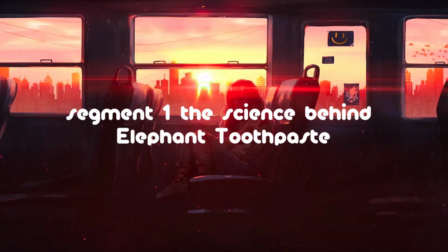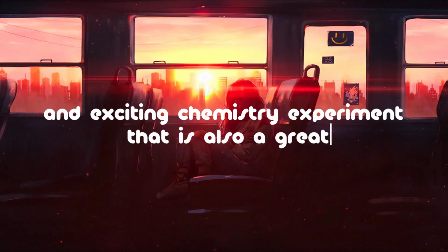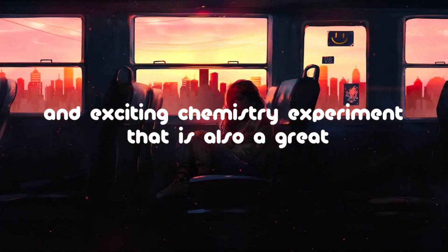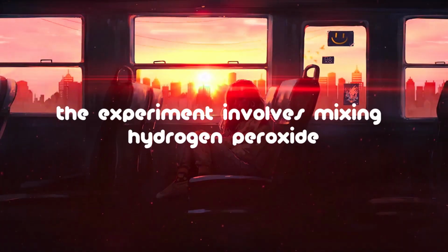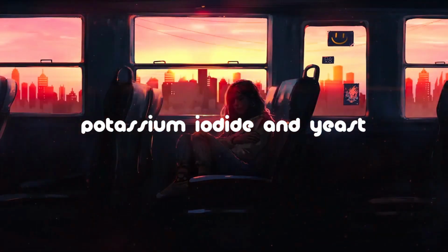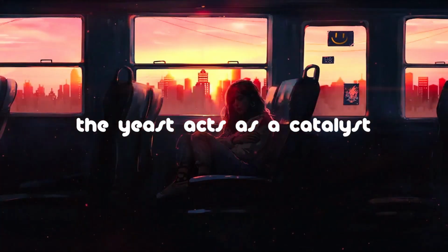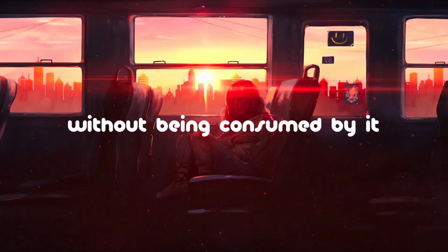Segment 1. The science behind elephant toothpaste. Elephant toothpaste is a fun and exciting chemistry experiment that is also a great way to learn about chemical reactions. The experiment involves mixing hydrogen peroxide, potassium iodide, and yeast. The yeast acts as a catalyst, which means that it speeds up the reaction without being consumed by it.